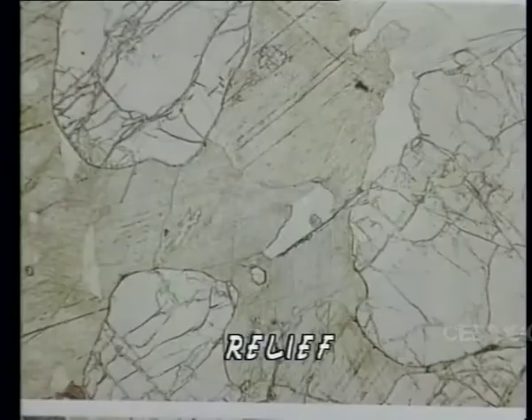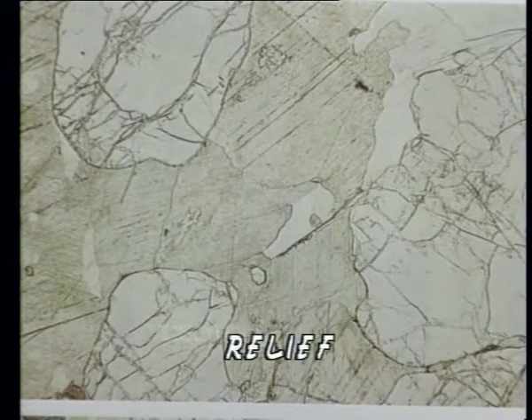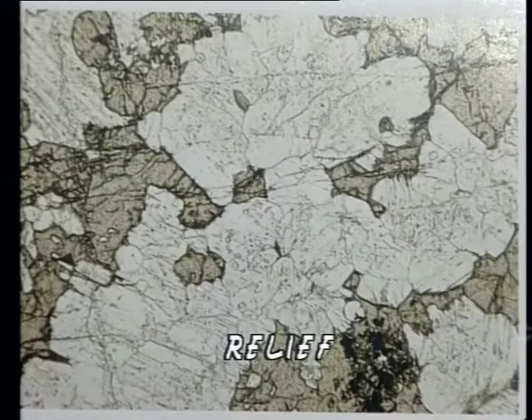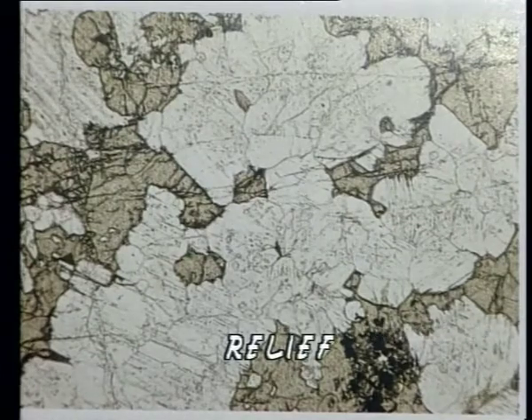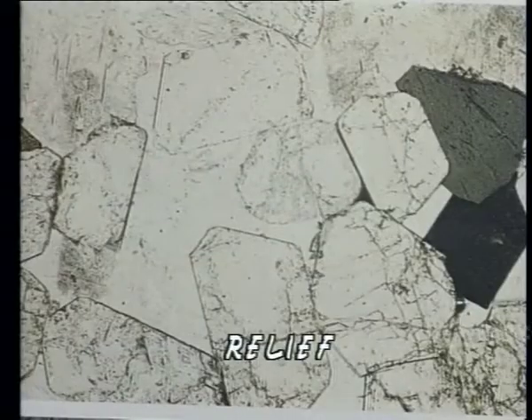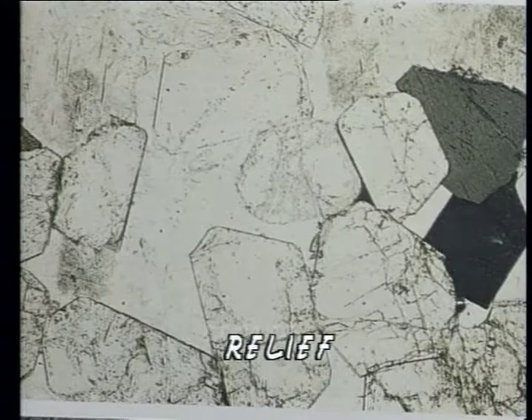In thin section, we normally come across several grains of either the same mineral or different minerals. Some minerals appear to have more distinct grain boundary than others. The distinction of grain boundary is measured as relief of a mineral. Relief is proportional to contrast in refractive index between a particular mineral grain and those surrounding it.